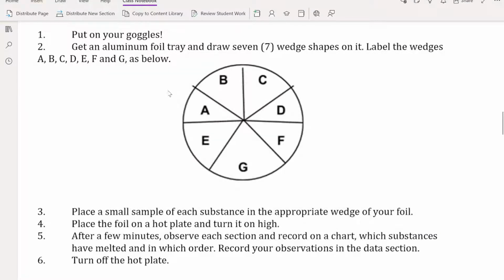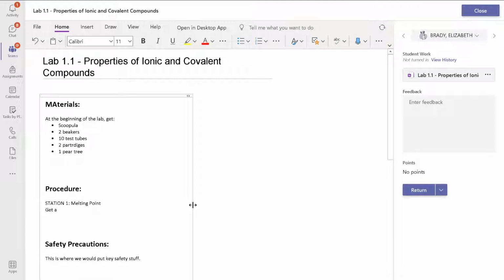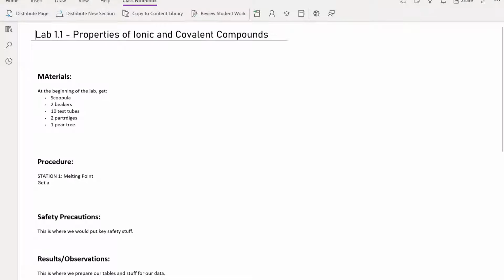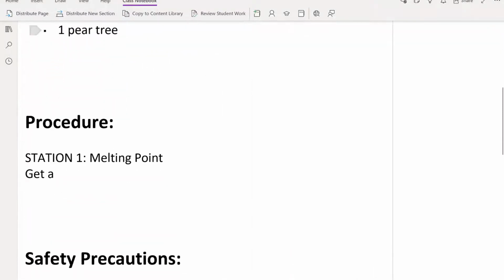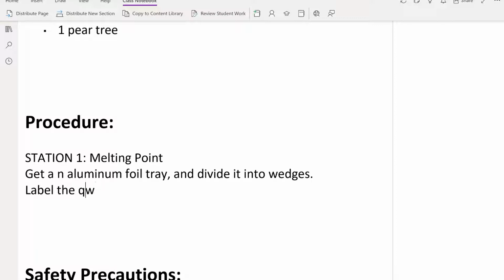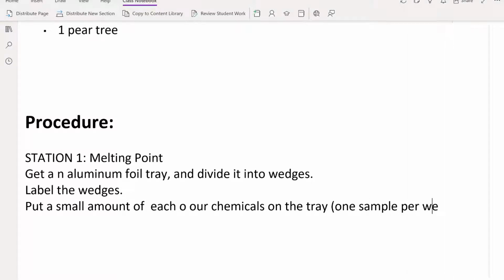So now that we know that, I'm going to write this in my own words. I'm going to say, okay, procedure, station 1, melting point. And then I'm going to open this in the desktop app just so that you can read it, so I can zoom in. So I'd say, get an aluminum foil tray and divide it into wedges. Label the wedges. Put a small amount of each of our chemicals on the tray. One sample per wedge.